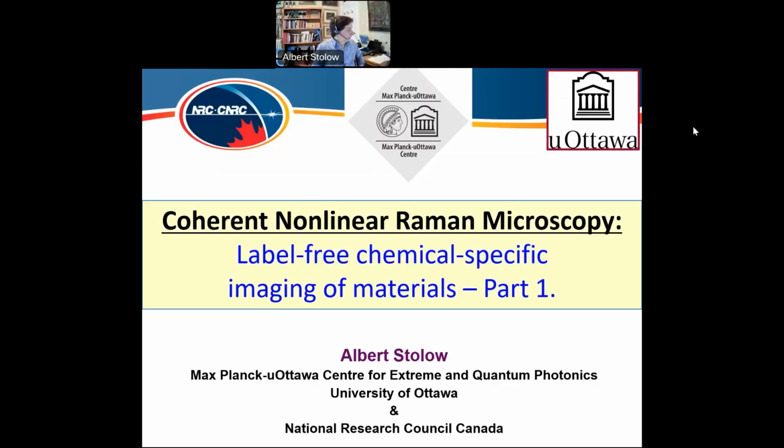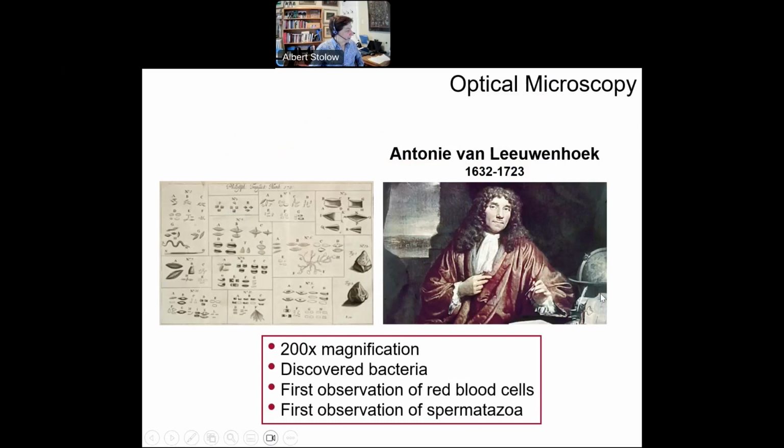So you can see my title, Coherent Nonlinear Raman Microscopy. And this is interesting because it is a label-free but chemical-specific way to image. And I will explain in this lecture exactly what I mean.